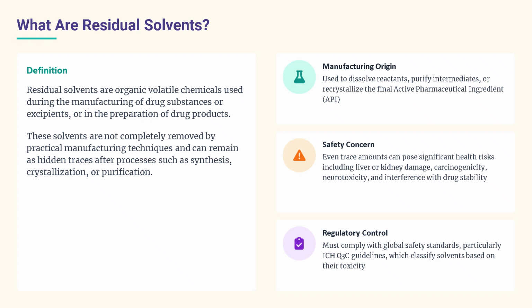Here's the problem: even trace amounts can be toxic. Some solvents cause liver or kidney damage, others are carcinogenic, and some interfere with drug stability. That's why regulatory agencies, the FDA, EMA, and ICH, require every manufacturer to test and control residual solvents in accordance with ICH Q3C guidelines.